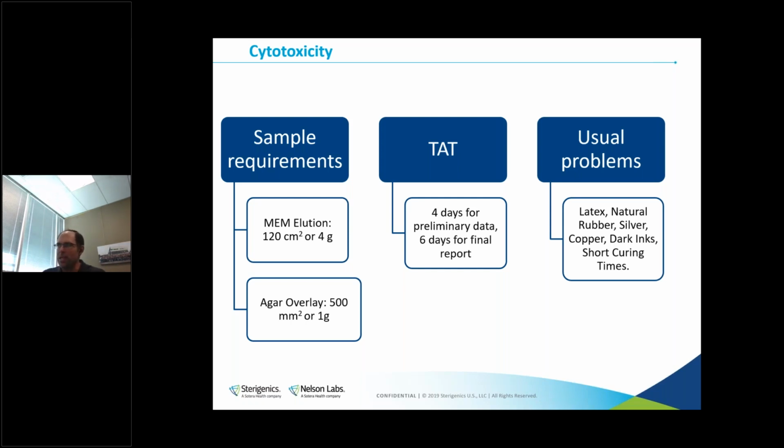It gives you the sample amounts we need. The turnaround time, like you can see, it's a very quick test. It can be done very quickly. And so it depends on how needed these results can be.